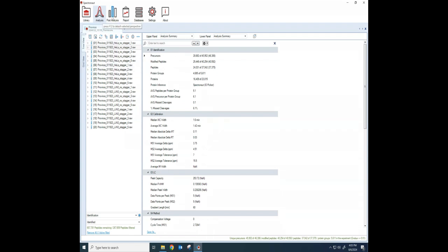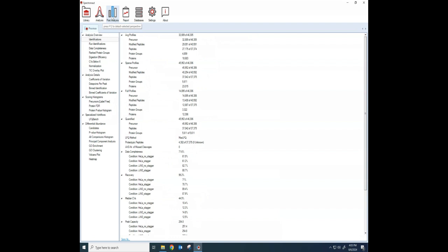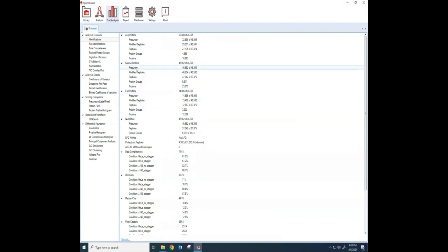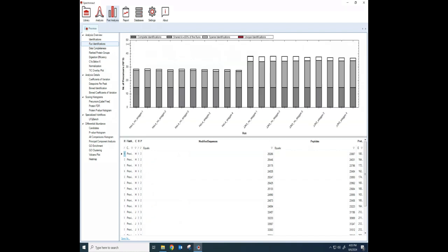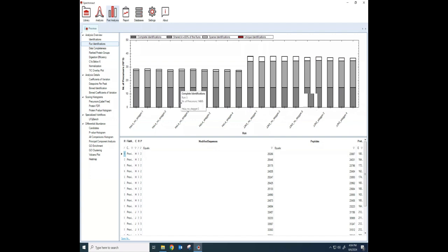One of the things you like to do is to go to the Post Analysis where there's some more QC metrics here that you can look at under Identifications. I like to go to Run Identifications here, and as it loads in my data, it's just a quick way for me to look and see. I had a couple of different experiments here going on. I had HeLa cells versus JJN3, and I also did a couple of different DIA data collection methods. One was called No Staggered, where the windows were not staggered, and the other one, the windows were staggered.